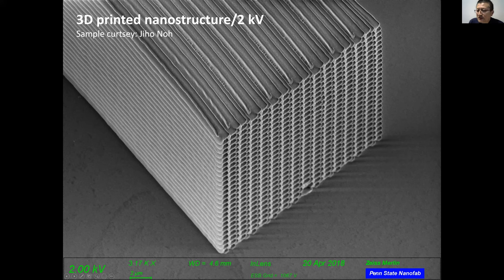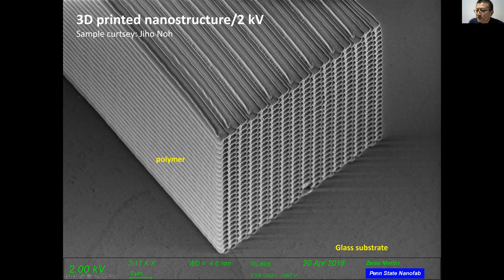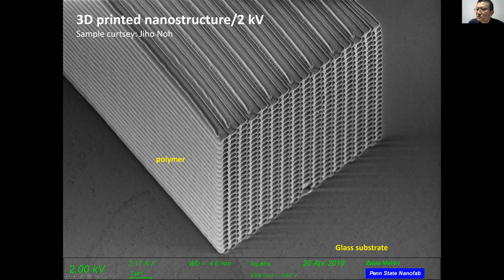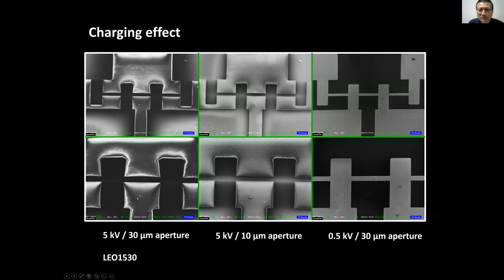This example shows a 3D printed polymer structure on glass — the entire sample is insulating. When imaging insulating material, you typically get a charging problem. To overcome charging, sometimes you need to lower the voltage. Here I show what charging looks like: a metal contact structure on an insulating substrate, imaged at 5kV with a 30 micron aperture, shows clear charging artifacts.